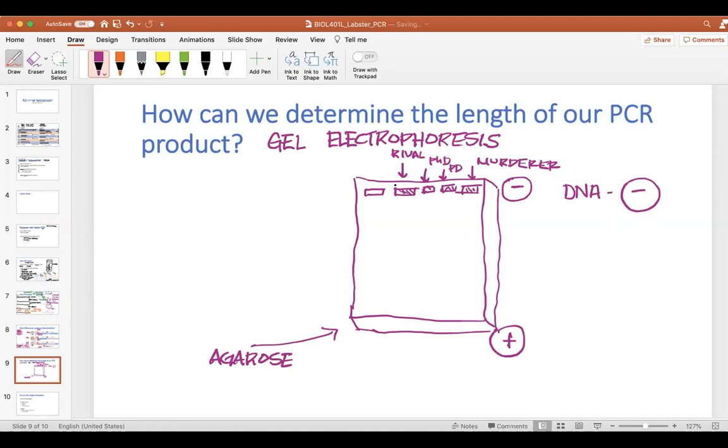Now, what's interesting about this whole process is if we could cross-section this gel, if we cut it in half and look at a cross-section, so now I'm looking at a cross-section here, and we could look at it really up close with the microscope, what we would find is that it is actually composed of a series of fibers, right, that make like a mesh.